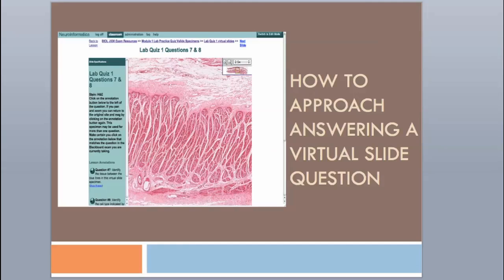Well, this short video will go over some steps to help you get started with the process of how to think through these slides like a histologist. For example, I'm utilizing question 7 from your first practice lab quiz to help you go through the steps. I highly recommend these lab quizzes to assess where you are in your understanding of the information you're studying in WebMic, so that you will know if you need to review more material before taking your module quizzes. And the module quizzes are there to help you prepare to take your midterm and your final, which are weighted very heavily in this class.